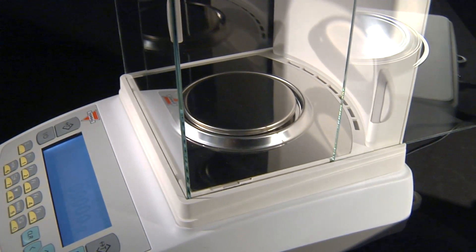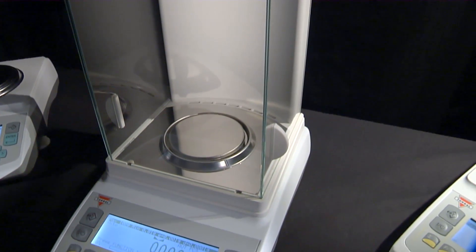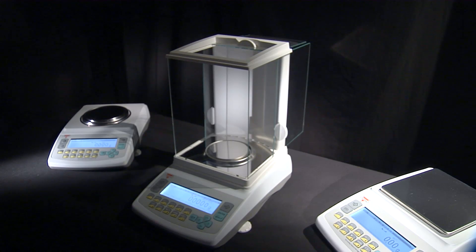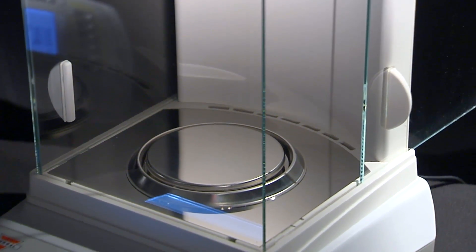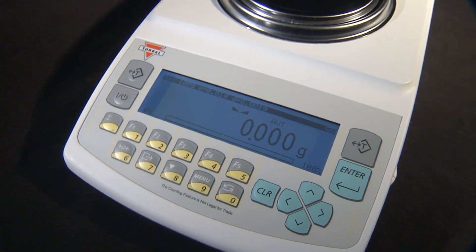Each unit is furnished with a stainless steel pan that is resistant to chemicals and staining. The AG analytical balance is equipped with a large chamber measuring 9 inches in height and 6 inches in width. Both sides as well as the top of the chamber open to provide the user comfortable access to the weighing pan.